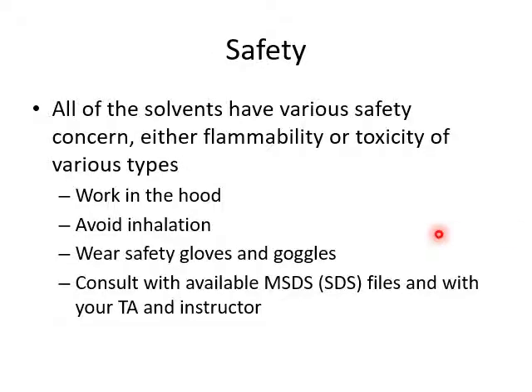About the safety, you need to work in the hood, avoid inhalation, and wear safety gloves and goggles. So that's for your class today. Good luck, guys.